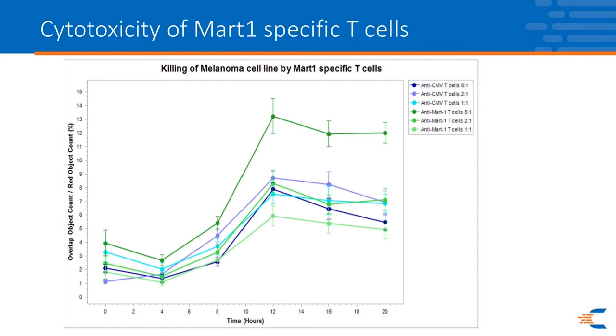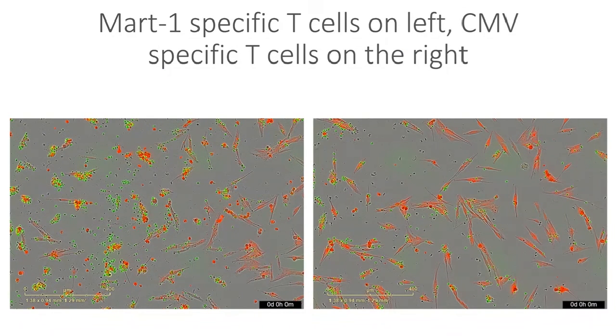And so in this experiment, we included T cells that are specific for cytomegalovirus, and those are shown in the blue lines. There is no cytomegalovirus in this culture, so the degree of killing we're seeing by those T cells is probably just background, and it seems to be about 8% in this example. And honestly, using other tumor targets and different combinations, that 8 to 10% may be about background. That, at least with these particular CMV T cells, there's some killing of the tumor cell that looks real at some level. And I can show you what that looks like in an image-based format below.